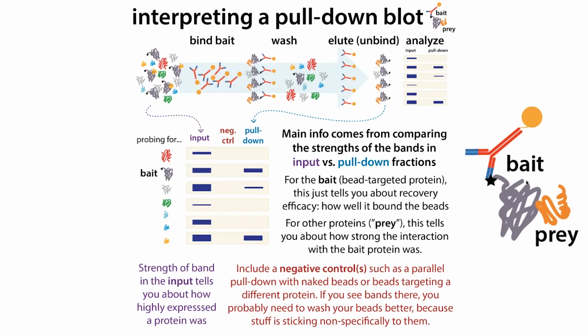So in this example, we would initially have antibodies that targeted this purplish gray protein. We would see if it pulls down the orange protein. Then we would take the orange protein, capture it, and see if it pulls down the gray purple protein. You might have to label the orange one and stuff like this, so it can take more work, but it could be a really convincing way to show that these are actually interacting.